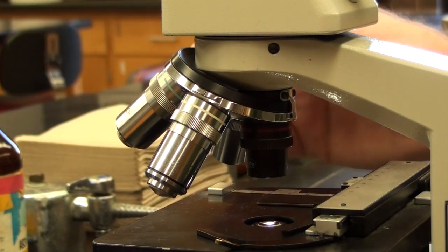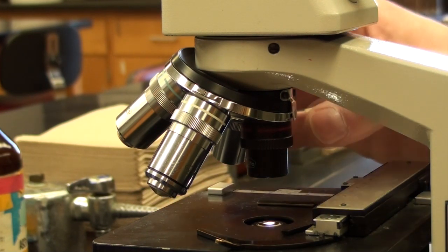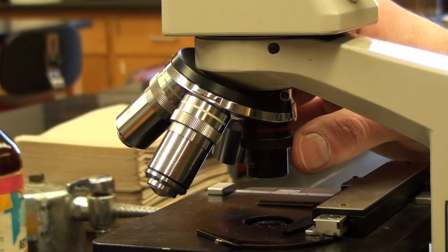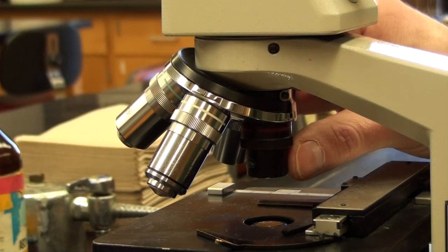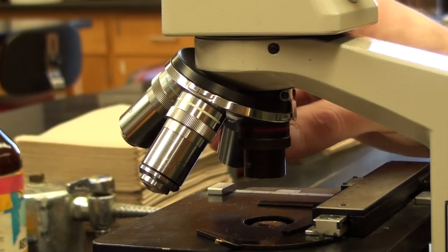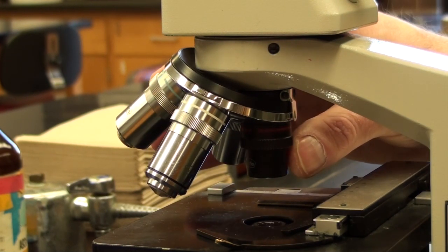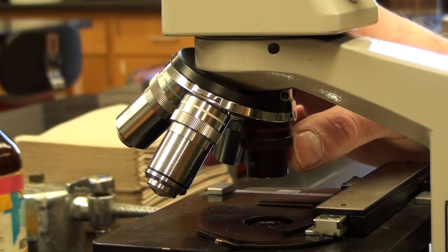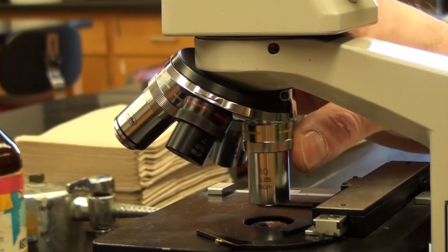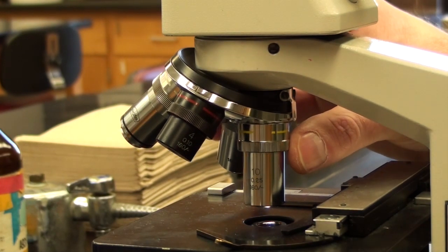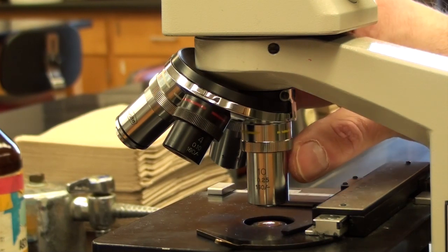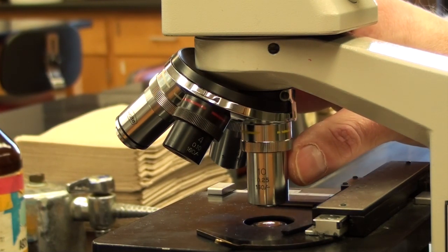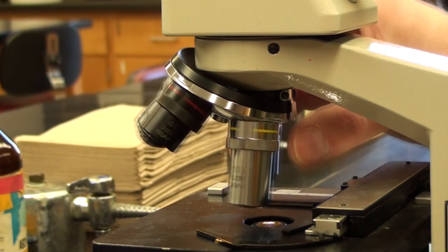This might be a good position to see what the iris does. Typically, one of the problems students have is under low objective, it's a very big lens, so we don't need as much light. We can dial the iris down to decrease the amount of light. As we move up in magnification, we'll want to increase how much light is coming through the iris, because the lens itself is smaller in diameter and can't capture as much light.